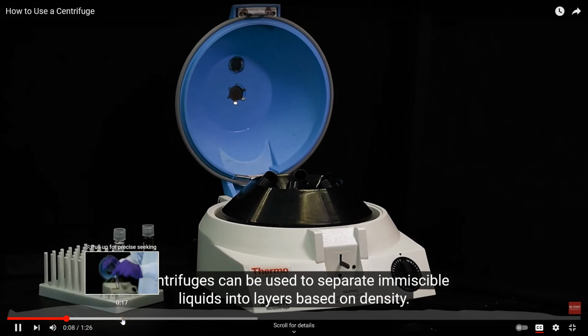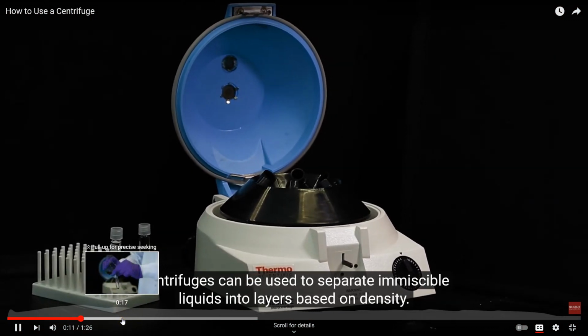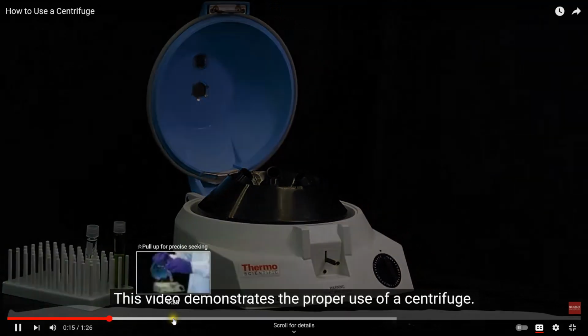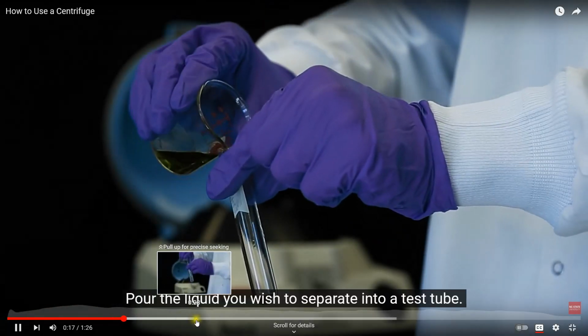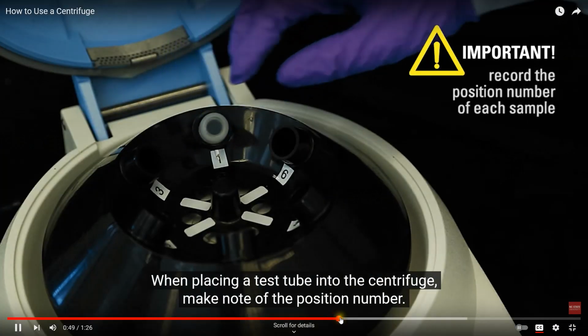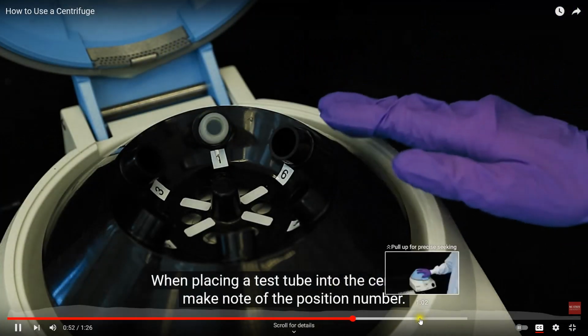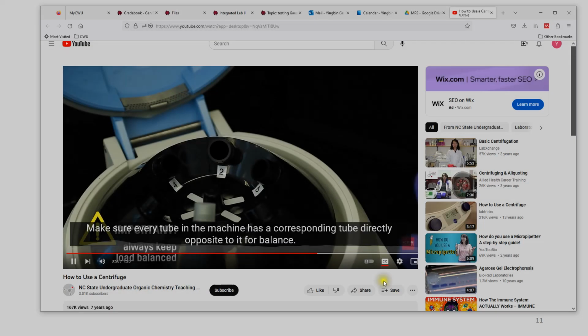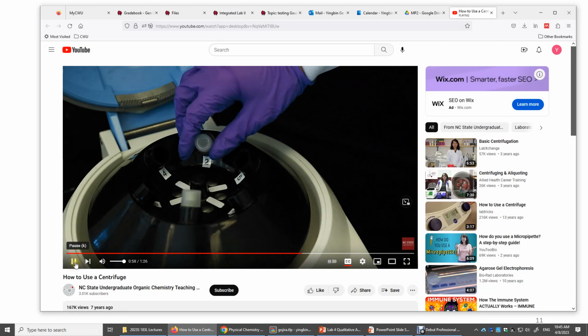Centrifuges can be used to separate immiscible liquids into layers based on density. This video demonstrates the proper use of a centrifuge. Pour the liquid you wish to separate into a test tube, with another test tube placed directly opposite it. Make note of the position number. Make sure every tube in the machine has a corresponding tube directly opposite to it for balance.